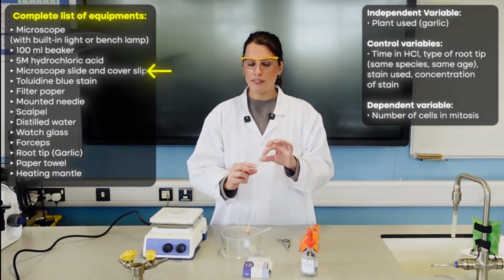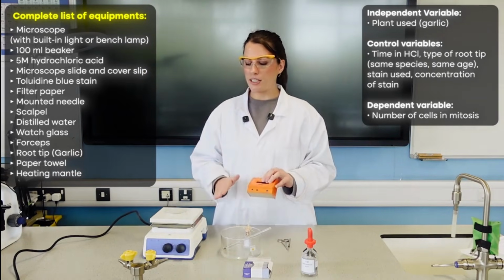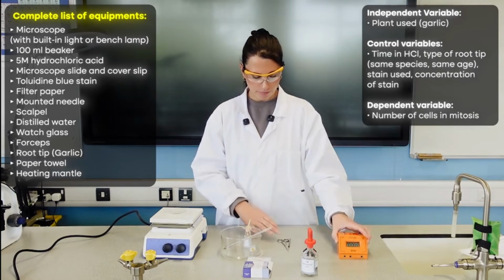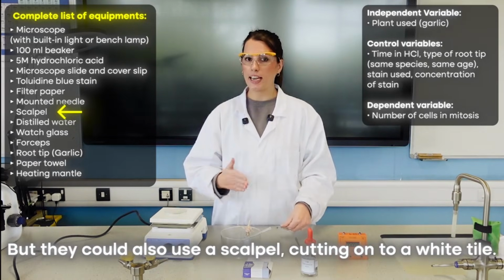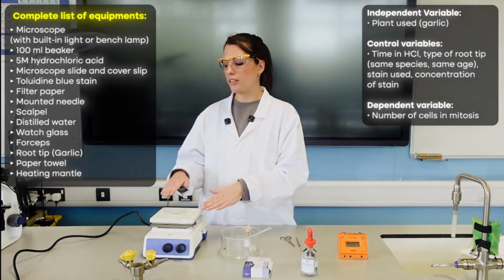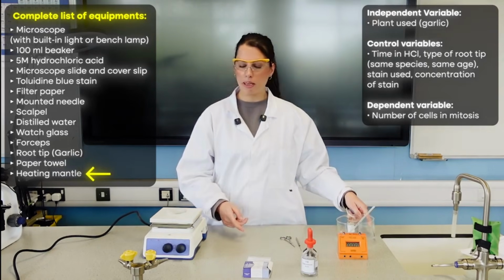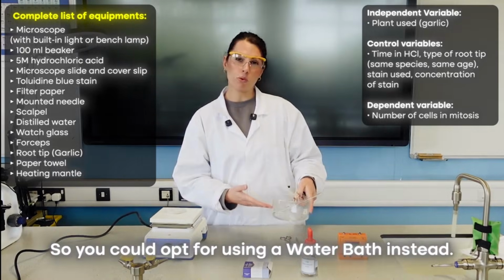We have our slides and our cover slips. I've got a stop clock here because some of the stages we need to leave to happen for about 10 to 15 minutes, but they don't have to have accurate timings for that. I've got a mounted needle, and I've got some sharp scissors, but you could also use a scalpel cutting onto a white tile. And for the heating stages, I'm actually going to opt to use this heating mantle, this heating plate, because it's far safer in terms of not having hot water that could scald and spill, and not using a naked flame. But you may not have this, so you could opt for using a water bath instead.